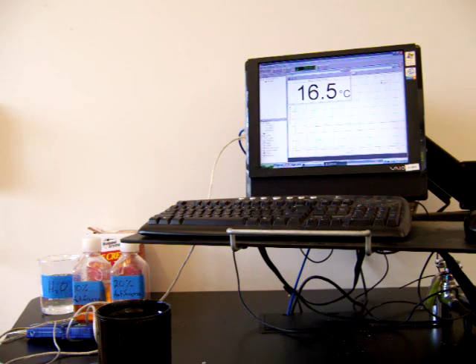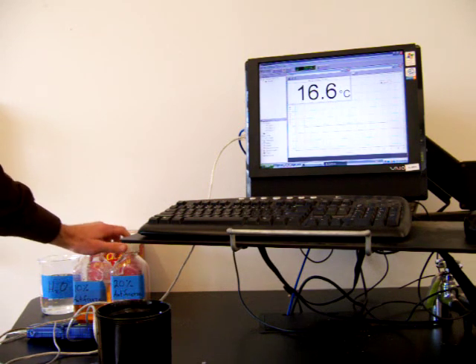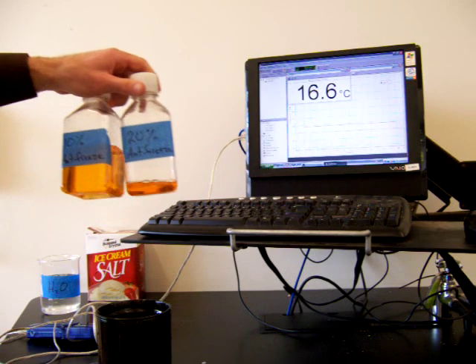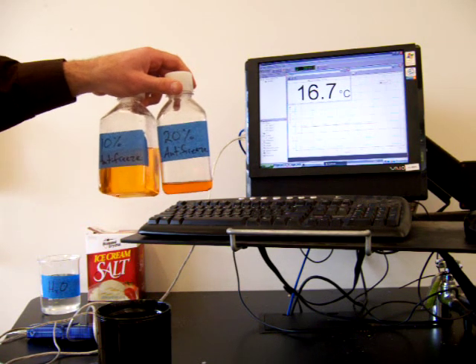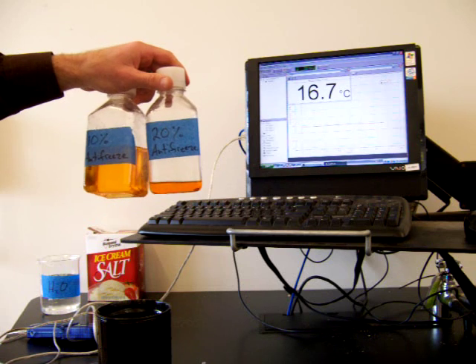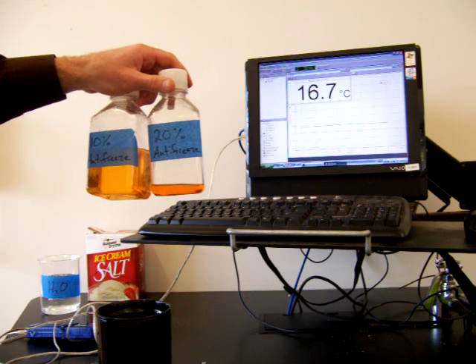This is the freezing point depression lab where we're going to try to determine the molar mass of antifreeze. I've got a couple of antifreeze solutions mixed up here. One is 10% antifreeze that was made by dissolving 10 grams of antifreeze in 90 grams of water.